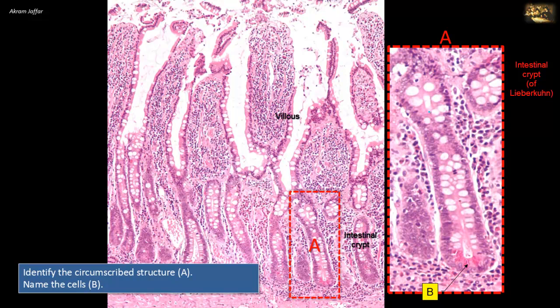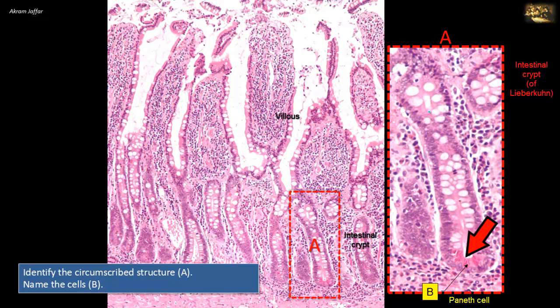The lining epithelium is a simple columnar epithelium formed mostly of enterocytes and goblet cells. However, there are other types of cells, like the ones marked in B — these are Paneth cells. They are characteristically located at the base of the crypts, as clearly shown here. They have prominent eosinophilic apical granules. The granules contain antimicrobial enzymes and provide a first line of defense against disease-producing microbes that survive passage through the stomach.